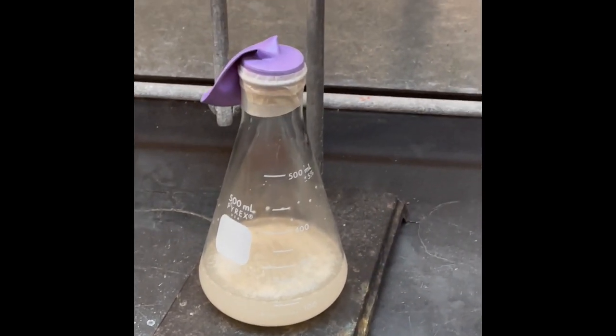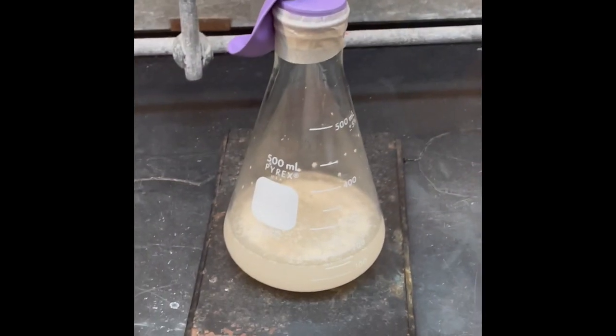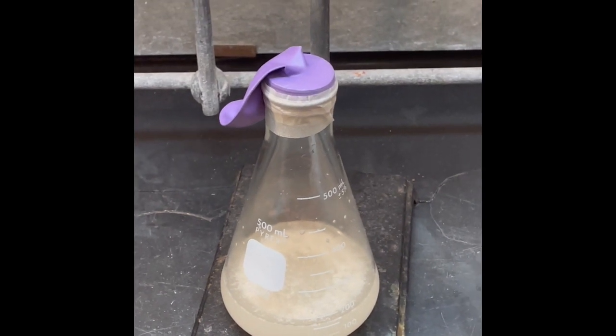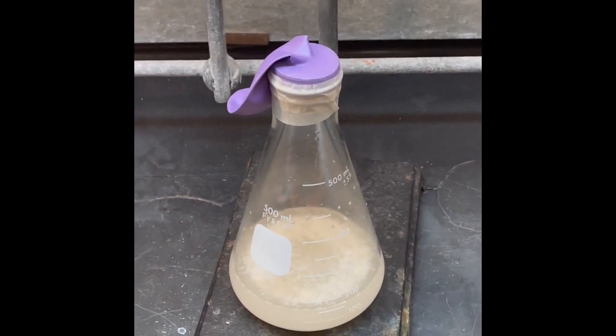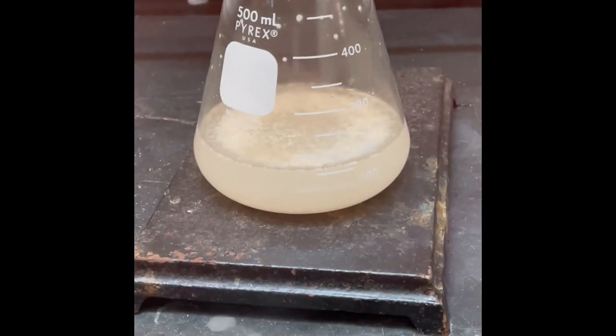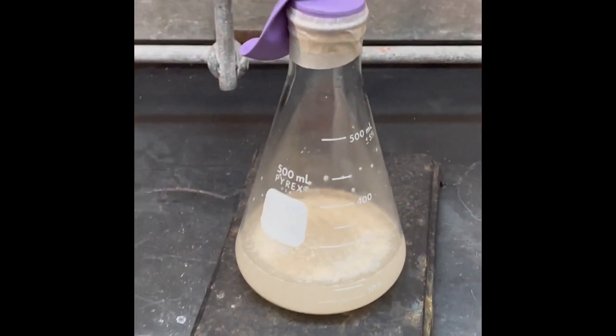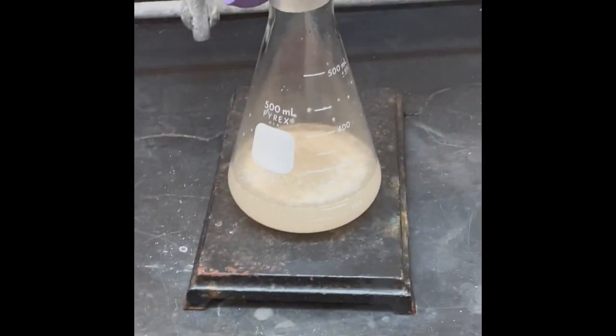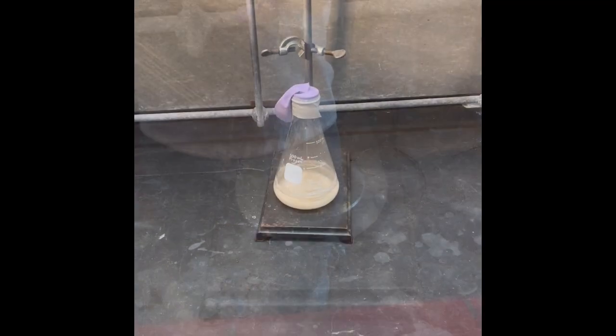You do risk the balloon popping off, so I taped it. You also risk having holes in the balloon, so you'll have to check on it frequently to make sure that it is in fact expanding or showing signs of evolution of CO2. As long as it's producing CO2, you are getting product. There's also this heat lamp here, it's just warming this guy up, so that fermentation works better, okay? Oh no. So the lamp is still on. But, oh, hello.